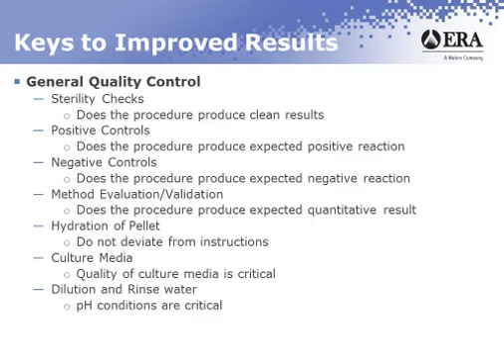The reason is it's not uncommon for DI or distilled water to have a pH that is, well, something other than what would be ideal. And that can cause inhibitory effects on the organism. Take a look at standard methods, section 9050C. It'll give you the instructions on how to make buffered water or peptone water.